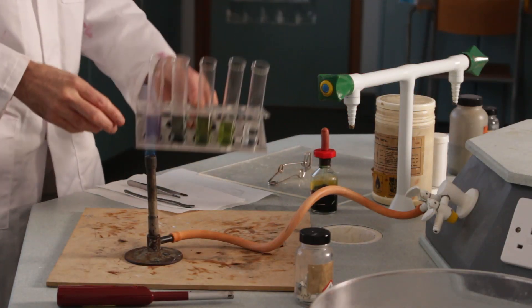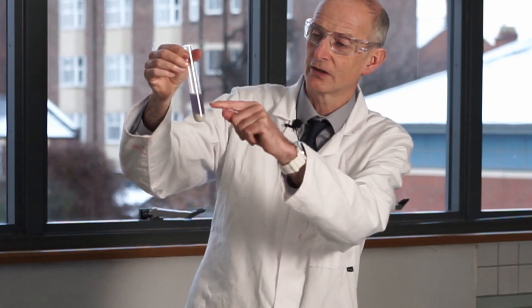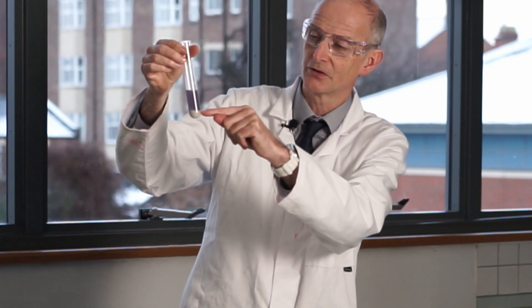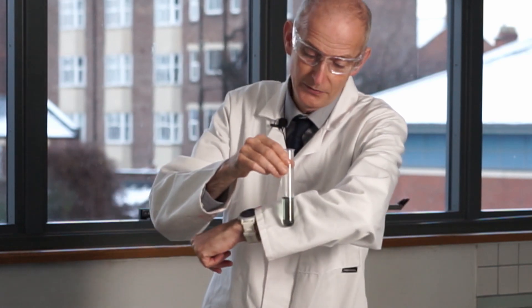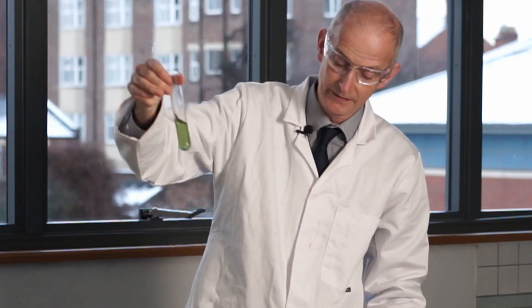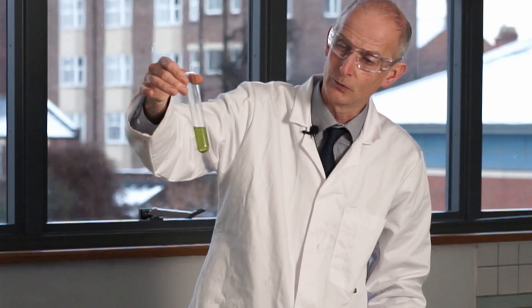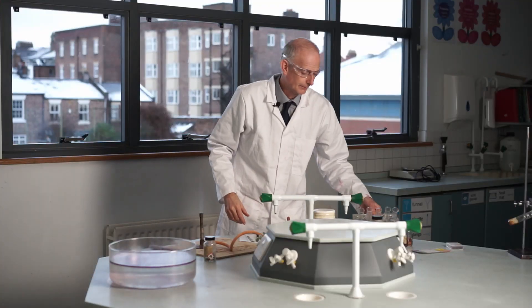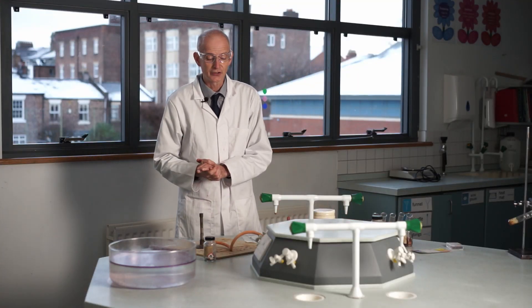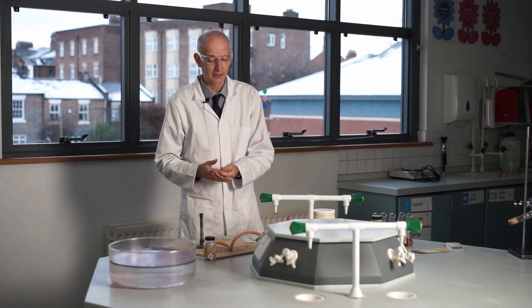Looking at all the tubes in turn: the calcium one — you can see all that white stuff that's sunk down to the bottom, the precipitate that formed. The magnesium one has definitely got a blue tinge rather than being green. The iron one is still green, and the copper one is still green and hot. I have a feeling that sodium and calcium are the only two that reacted clearly.